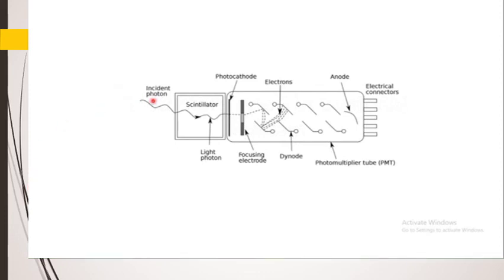So there is the incident light. Incident light is the emission light from the fluorophore, and it hits a photocathode. Now this photocathode is generally made of multi-alkali or sometimes an alloy like gallium arsenide phosphide. Different materials can be used to build this photocathode. Depending upon the material used, the photocathode sensitivity can also change. However, when the light hits the photocathode, some electrons are ejected.